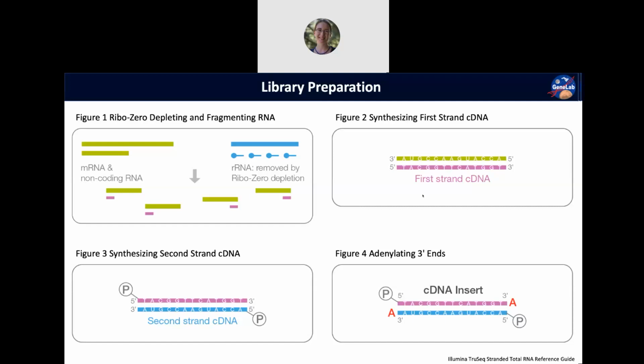I read the theory of why strandedness. So originally when they developed RNA-seq, it used to be not stranded, right? But then for some types of experiments of interest, so let's say, for example, you're looking for a virus or whatever, and you want to know the origin, the template that it came from.